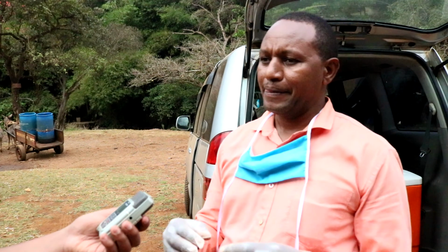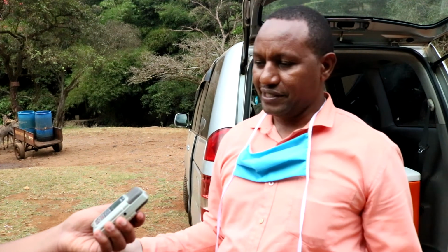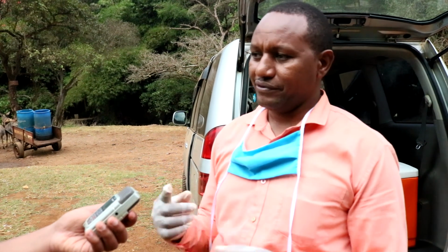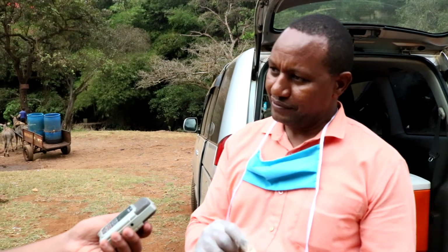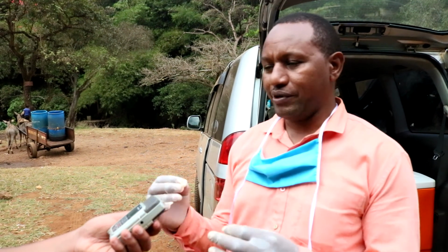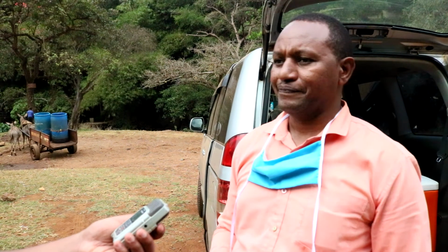And in the same way, we are going to do also the tomatoes from the 3 traders. Take all the samples, mix them together, shuffle them so that we get uniformity. Then we draw a sample of 1 kilogram, put in a clean bag, then do the weighing. So we are going to weigh 1 kilogram from the 3 samples. And then put it properly and seal it. And then we label the sample so that we know which market that we got the sample from.